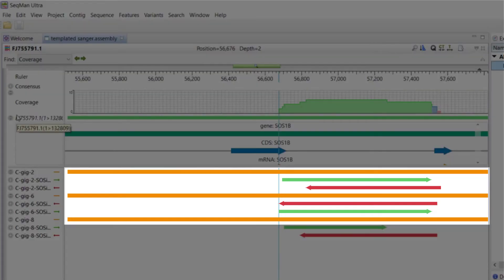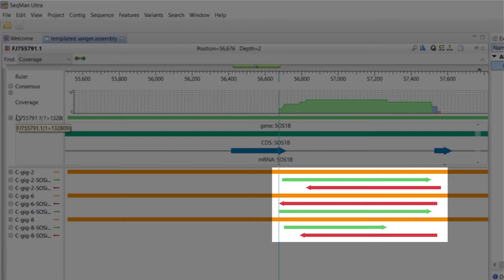Note that we see one pseudo-consensus sequence for each sample in orange. The forward and reverse reads for each sample are shown below this sequence.